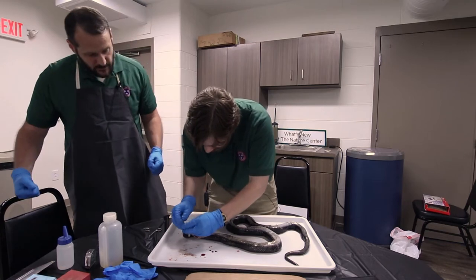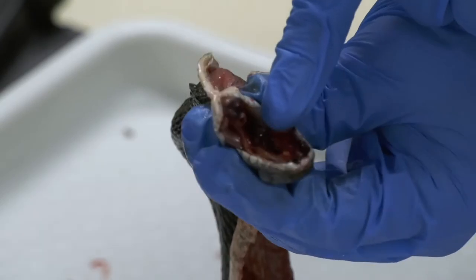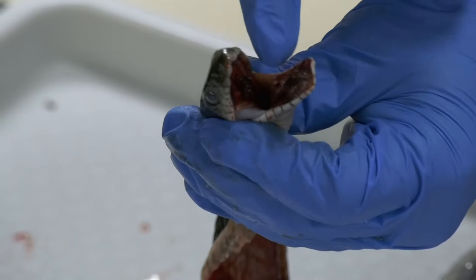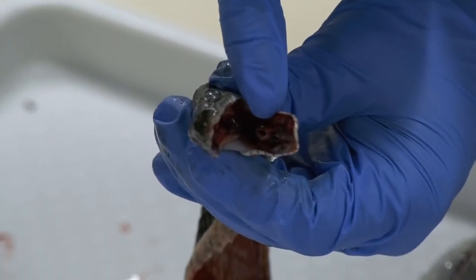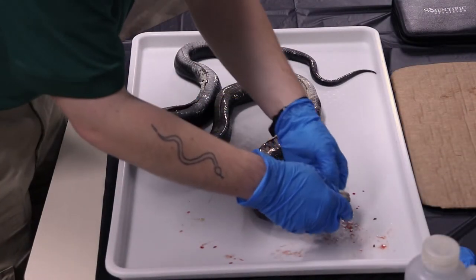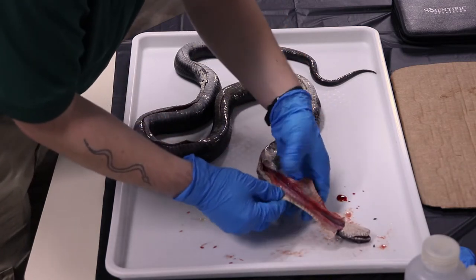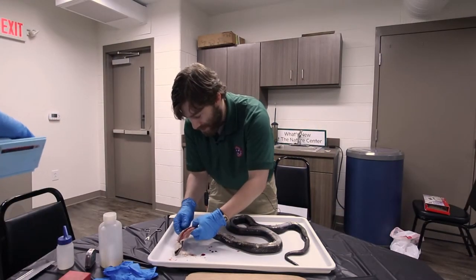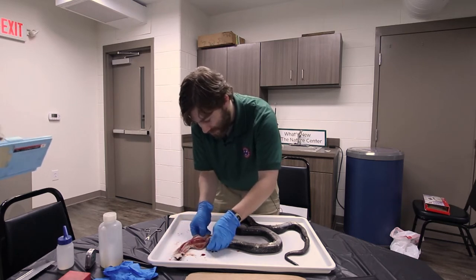If you open up the mouth, you can see that is the trachea. So that's how they can have a mouth completely full of mouse or egg or whatever their prey is and still be breathing out the lower jaw, the bottom of their mouth. Their trachea will basically stick out of their mouth a little bit while they're eating a large prey item. There's also a lot of musculature on snakes. So a lot of this meat is muscles around the sides.